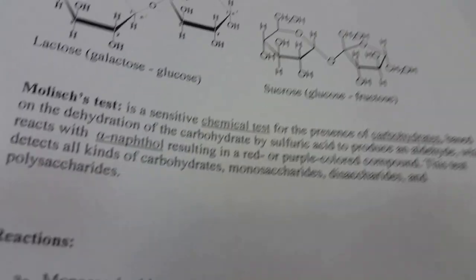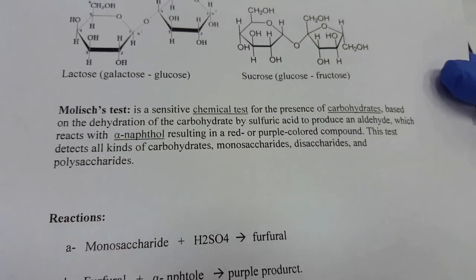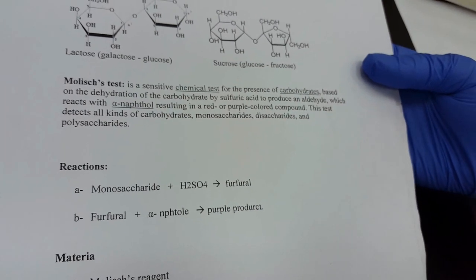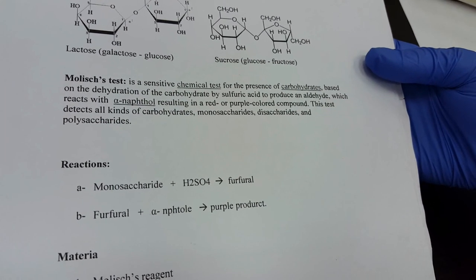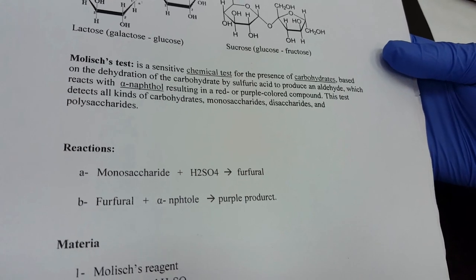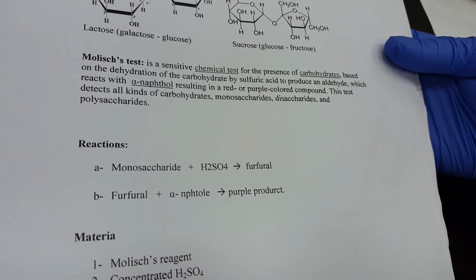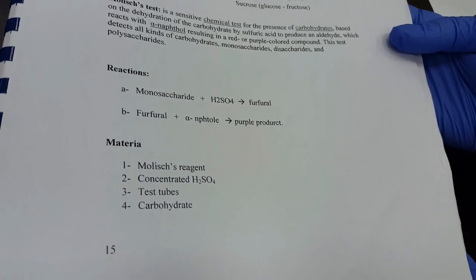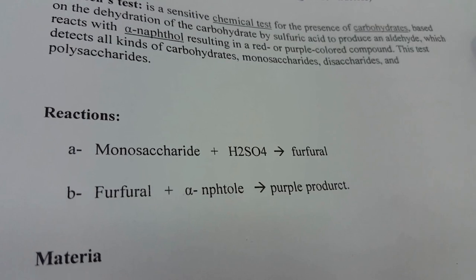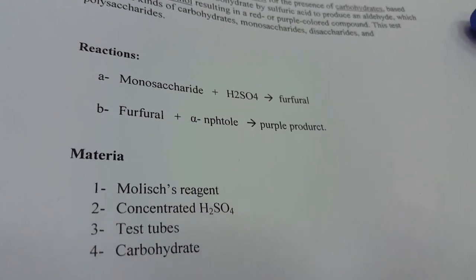The Molish test principle is stated in your manual. The Molish test is considered to be a sensitive chemical test for the presence of carbohydrates, so it should give a positive result for all carbohydrates. This is the reaction which has already been illustrated by Dr. Matkur. And we'll start now with the practical part.